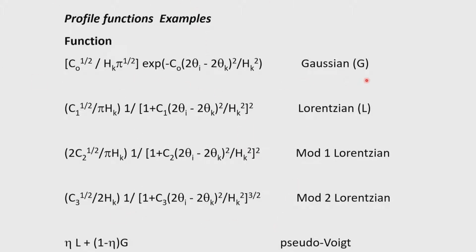One can use a Gaussian function if one is collecting neutron data. The peaks coming out from a neutron diffraction will always be Gaussian in shape. The reason is obvious, because the diffraction is not from the electron density around, but it is from the nucleus.